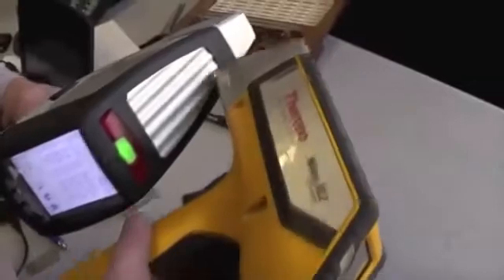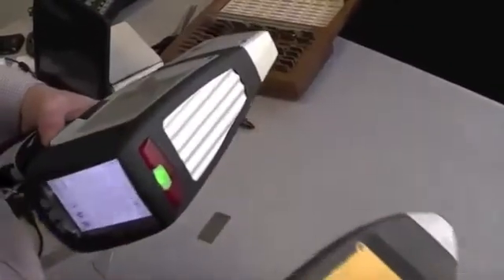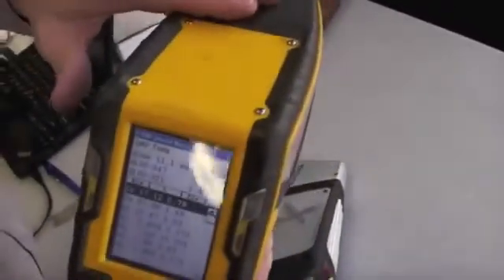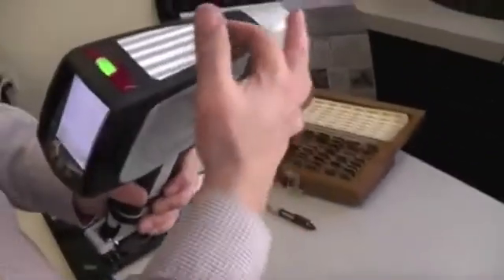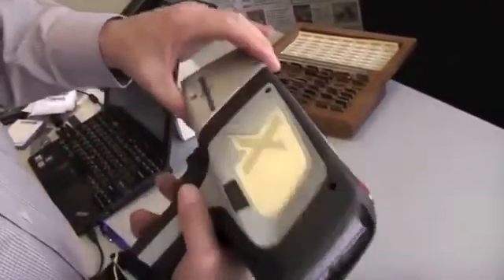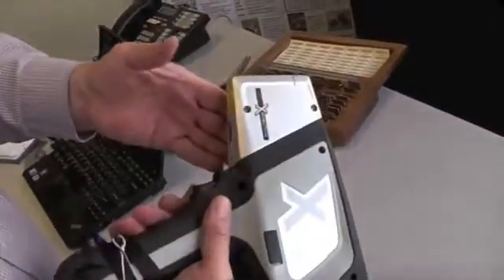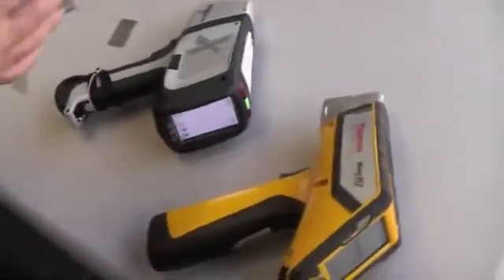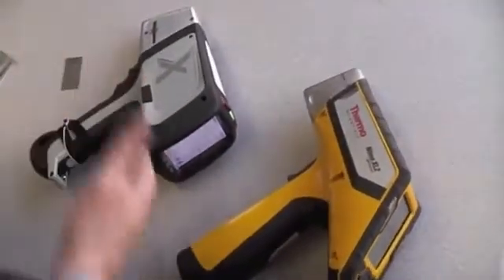We also have all this area here that is directly tied into the heat sinking. The heat sinking on this is really a lot of plastic, and the mass in their system comes from the battery, whereas in our system we're working with a smaller battery and a hot swap, but we've put quite a bit of metal in the interlocking rubber overlay, which we can do because we do a good job getting rid of the heat. Heat matters not only for hot samples but ambient temperature and lifetime of components.